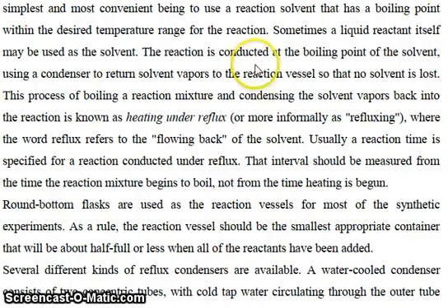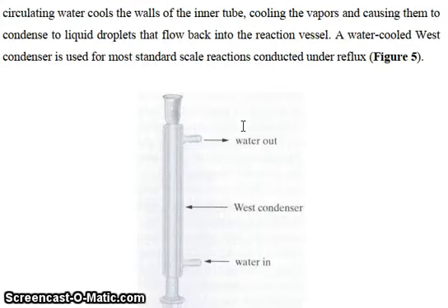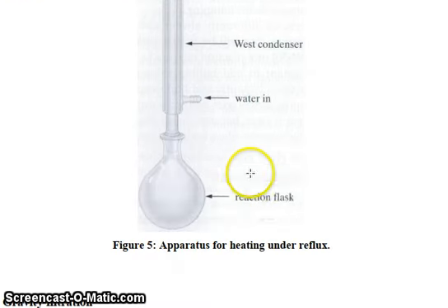A water-cooled condenser consists of two concentric tubes with cold tap water circulating through the outer tube and solvent vapor from the boiling reaction mixture rising up in the inner tube. The circulating water cools the wall of the inner tube, cooling the vapor and causing it to condense to liquid droplets that flow back into the reaction vessel. A water-cooled condenser is used for most standard scale reactions conducted under reflux. You see, water in, water out, the condenser, and this is the reaction apparatus for heating under reflux.